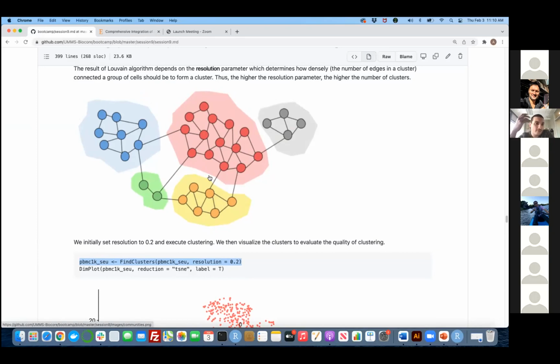What we actually have to do is keep dividing, keep searching for markers, and make sure that those markers are legit. Maybe you don't really need those markers. Sometimes you may be picking up two clusters that have two different markers, but they may not be really useful for the analysis that you're conducting. So you just play with the numbers, say, okay, find 3 clusters, and if that makes sense, you go with it. If not, you make 4 clusters. Exactly. So it's a treasure hunting process. You just have to keep playing and keep searching and keep analyzing the data.